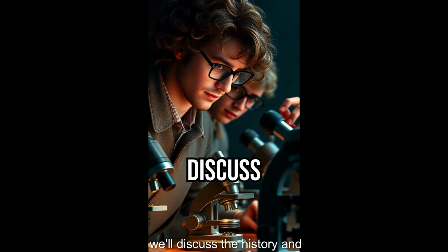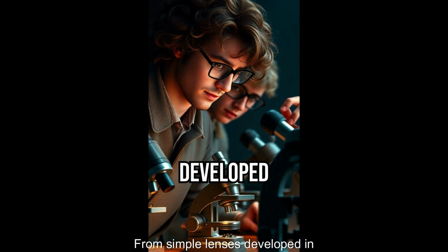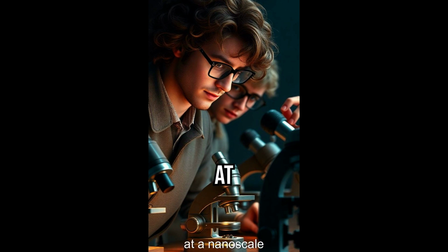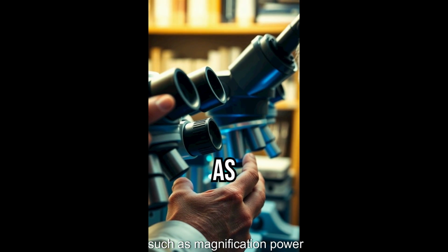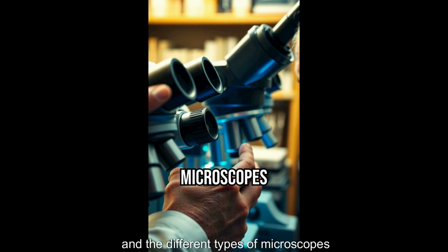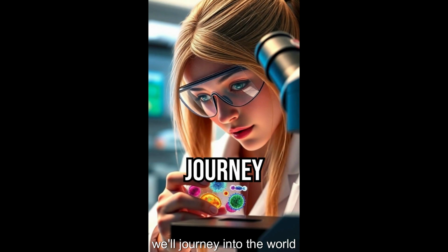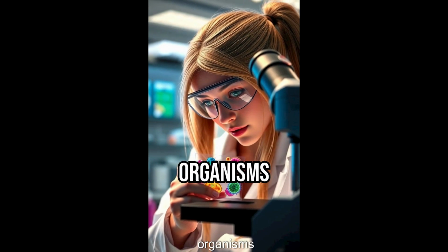First, we'll discuss the history and evolution of microscopes, from simple lenses developed in the late 16th century to the advanced electron microscopes of today that allow us to see at a nanoscale. We'll highlight essential features such as magnification power, resolution, and the different types of microscopes like optical, electron, and fluorescence microscopes.